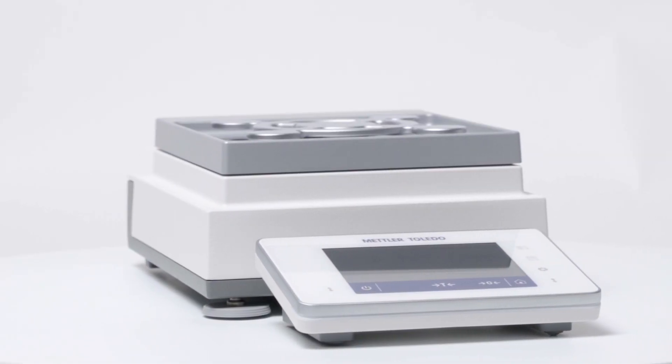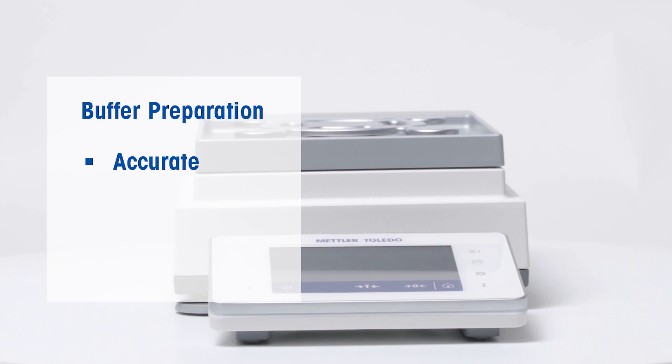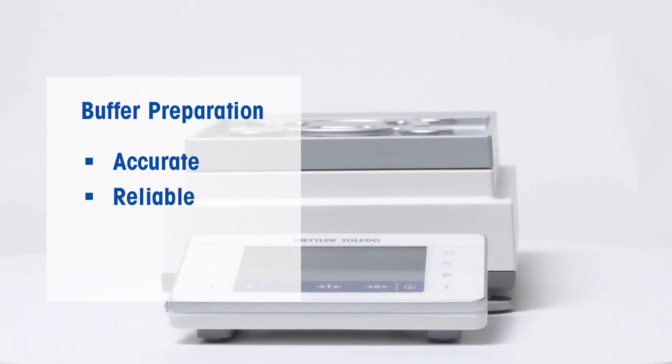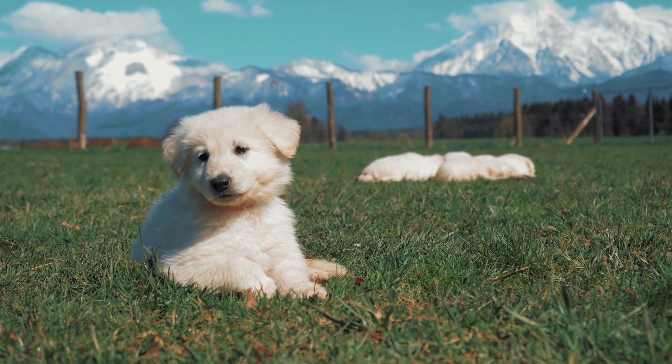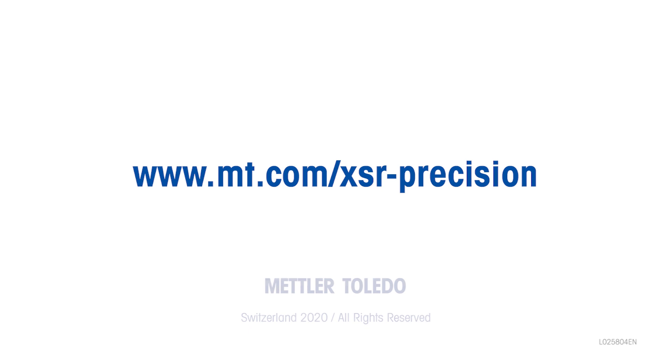Enjoy accurate and efficient buffer preparation with Mettler Toledo Laboratory Balances and ensure your products are reliable and consistent. Contact us today for help or advice on buffer preparation.